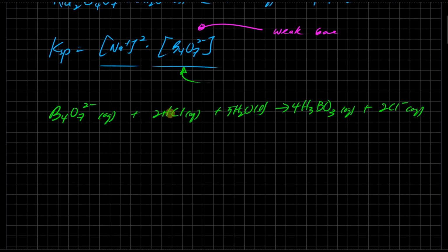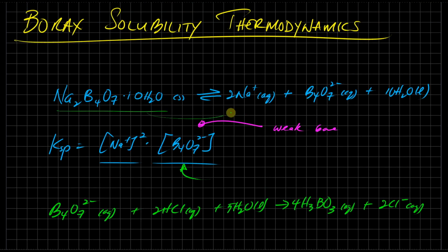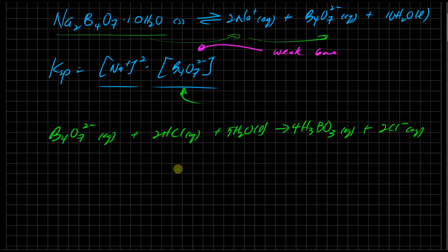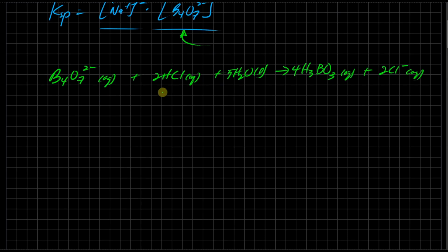So if we titrate our salt, we will dissolve some salt, we'll get our ions. We take that solution and we'll titrate it. Now, for Ksp to be accurate, we need to maximally dissolve this salt. So this will be prepared ahead of time, where somebody is going to dissolve the salt until it cannot dissolve anymore and filter out any of the extra solid that's there. And they'll prepare the solution ahead of time. So you just need to take that solution and titrate it with HCl.